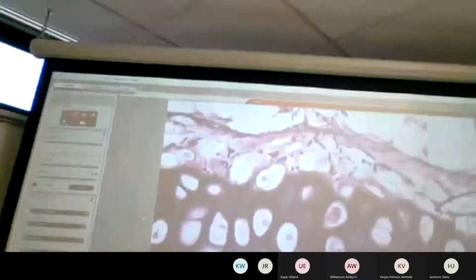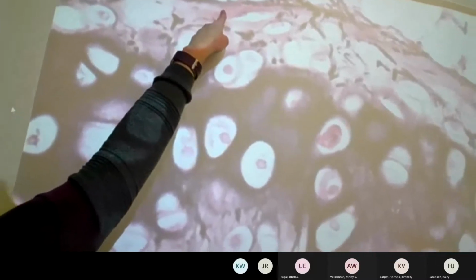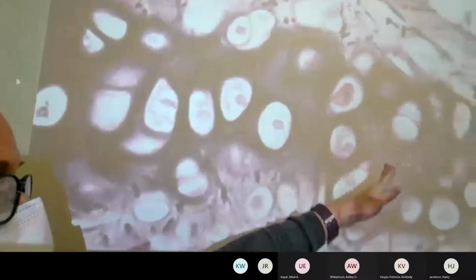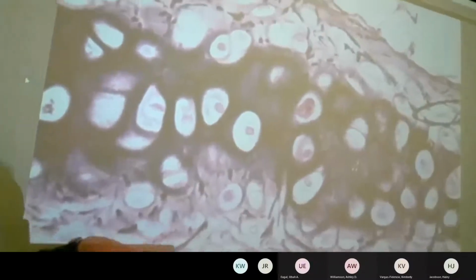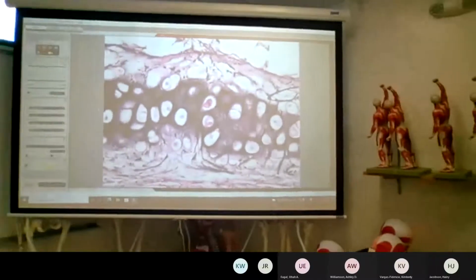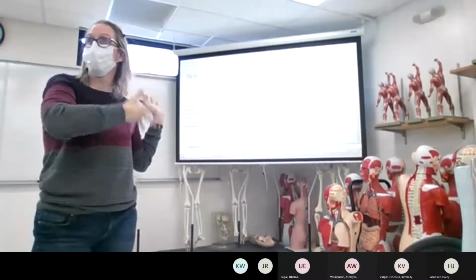okay, the part of the, so there's some fat up here. Then you kind of see dense irregular connective tissue because this is the perichondrium. Then you start to see the cartilage, and the cartilage, can't see it great here, but it's got a lot of fibers. So the matrix is a little jelly with some protein, and then you start to see again the perichondrium. Okay, chondrocytes sitting in a chamber, no blood vessels. But there's more protein, and so I'm telling you it's elastin protein.